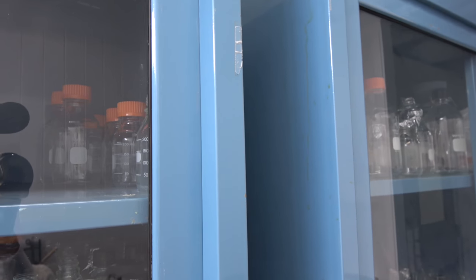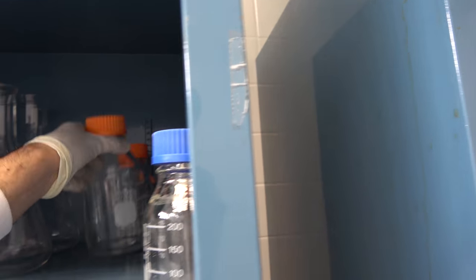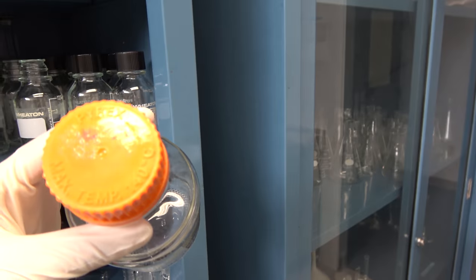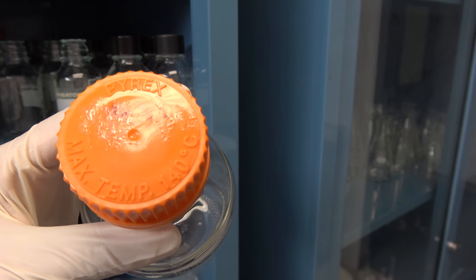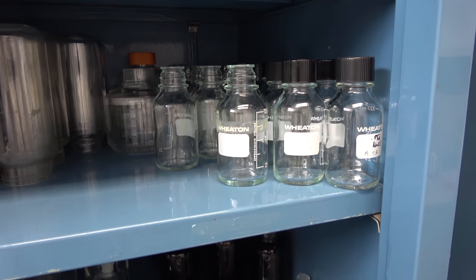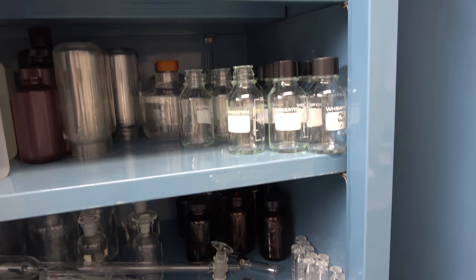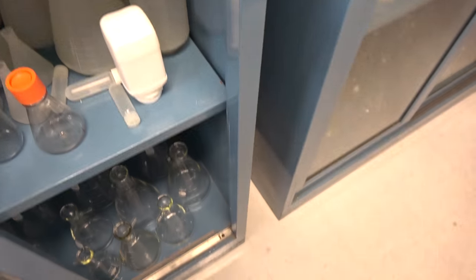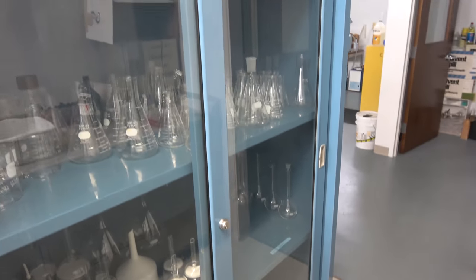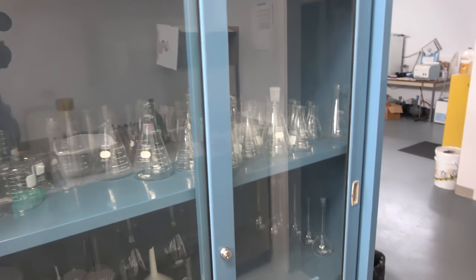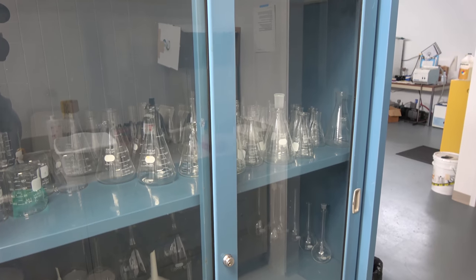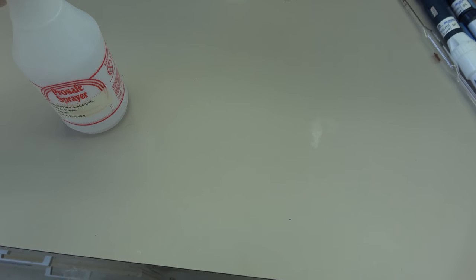You take it off from wherever you put it and you start using it on your lab bench. One very important thing, if you want to autoclave something, always make sure it's Pyrex. Pyrex can withstand very high temperatures. If you're not sure if something can withstand the autoclave, don't use it. It'll melt, blow up, God knows what's going to happen. In general, always make sure that what you're going to put in the autoclave can actually withstand the autoclave because it's going to be really fucking hot. It's like 140 degrees Celsius around there. Before you do anything, you want to spray down your work area with isopropyl alcohol.